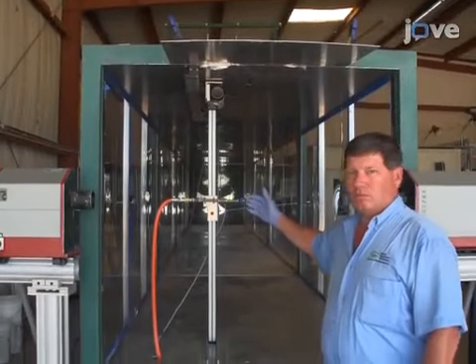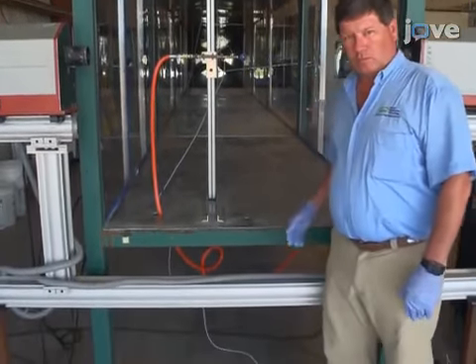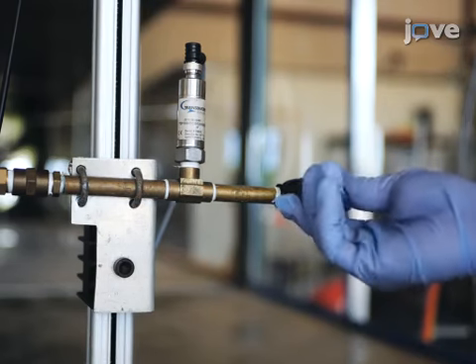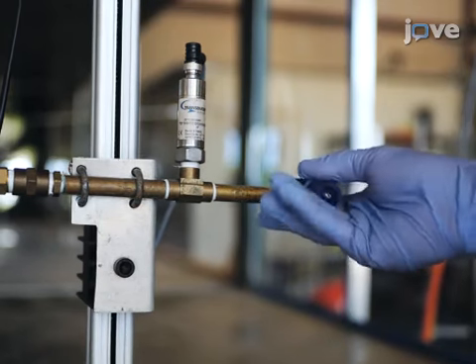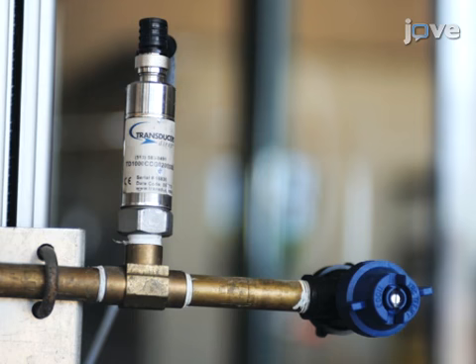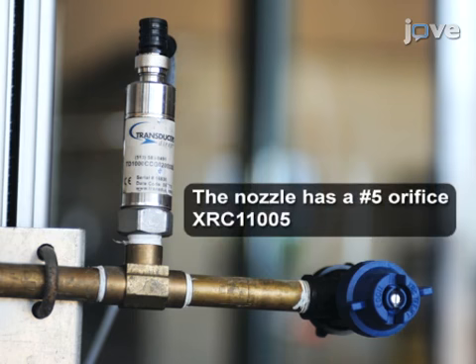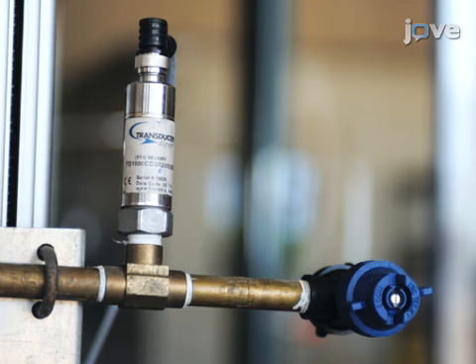Perform ground nozzle testing at the downwind opening of a large wind tunnel section. At the opening, mount a nozzle body, nozzle, and pressure gauge on a transverse system. This protocol uses a 110-degree flat fan nozzle with its long axis oriented vertically. Have an electronic pressure gauge just upstream of the outward-facing nozzle outlet.